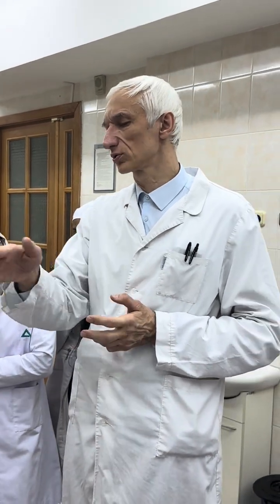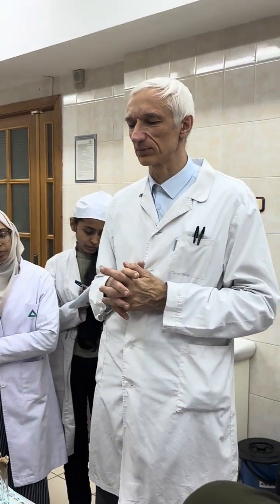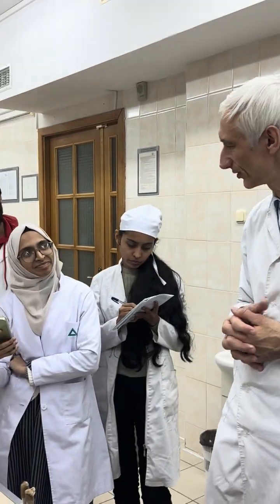Who makes a slide from simple medium? Drops fuchsin. Fuchsin is an enough intensive, short-time working dye; 1 to 2 minutes will be okay. I may allow you to use a mobile phone if necessary. Methylene blue, I hope you will also find methylene blue. It is given 5-7 minutes; it is possible to count this time, but usually in those 5-7 minutes we are doing something else, and I simply ask you to wash away the slide. Maybe that's all. After finishing, as I said, we will not subject it to microscopy. We will discuss something and drop the slides into disinfection solution. Okay, let it be.